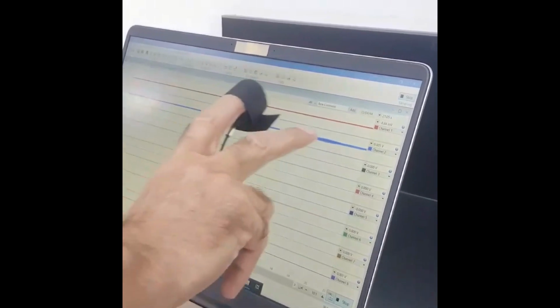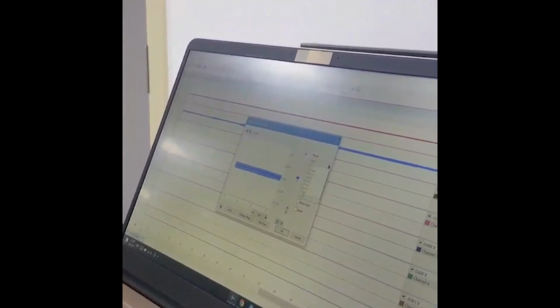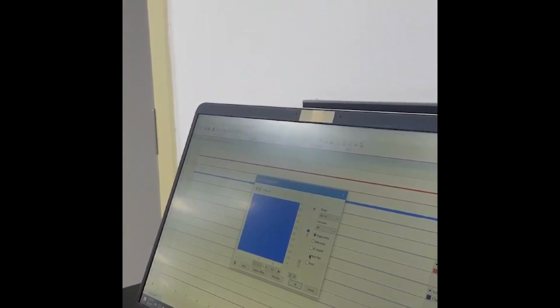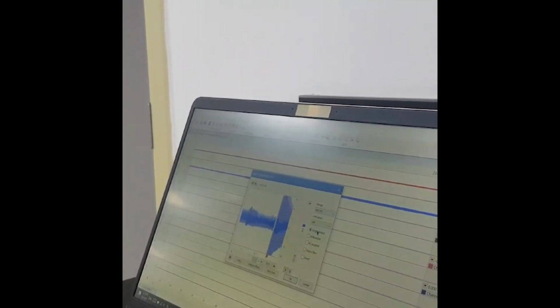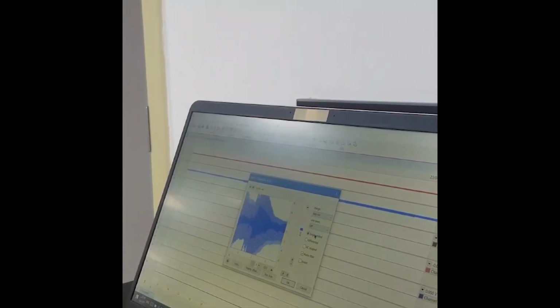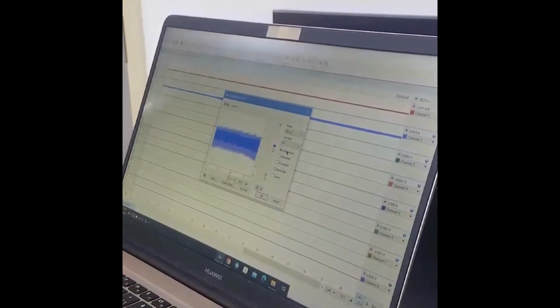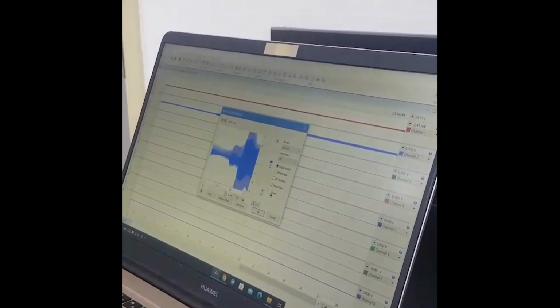So there should be a record there. Okay. Which is not very clear. Channel 2. We'll go and see what happens there. We have a very noisy signal. This is all noise.